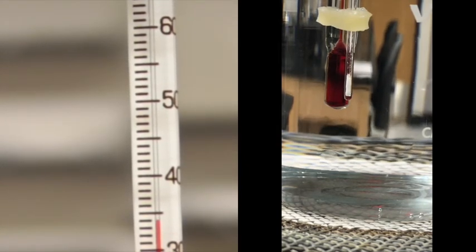Right, moving to about 35. Still no signs of melting.